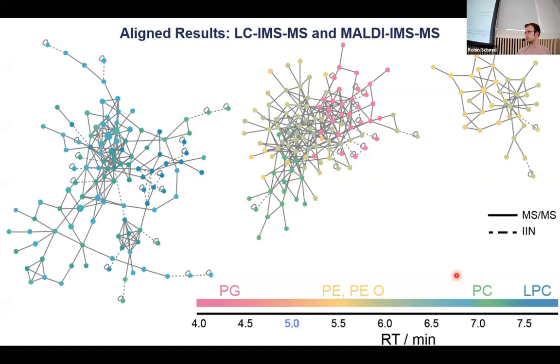It's not super established methods yet. All the labs are still developing methods for how to handle even smaller sample sets, like the 88 samples that we did today on all your little laptops. It's way harder to do that with 88 timsTOF files because they are massive.